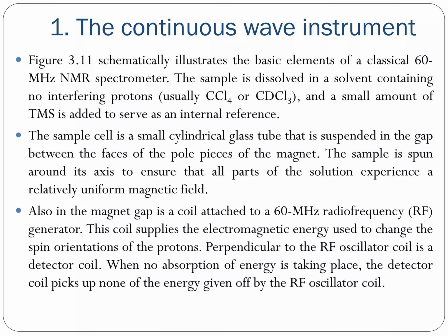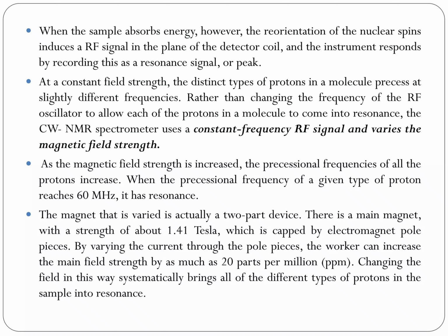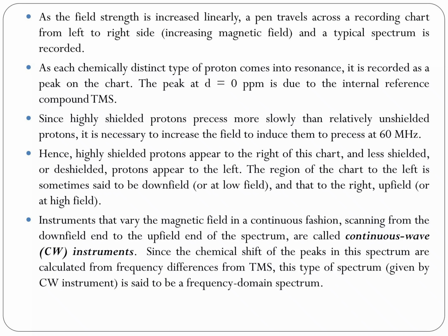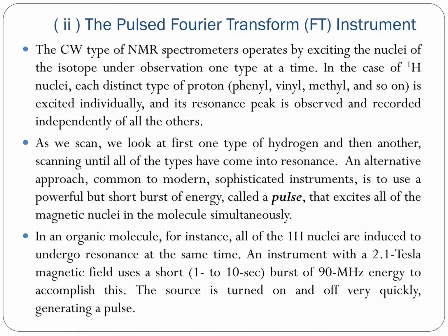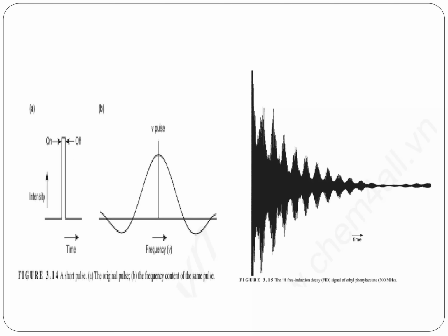Now, I have already discussed instrumentation. Just go through this. So, the pulsed Fourier transform instrumentation: the working principle has been discussed in the previous lecture. Just go through these contents.